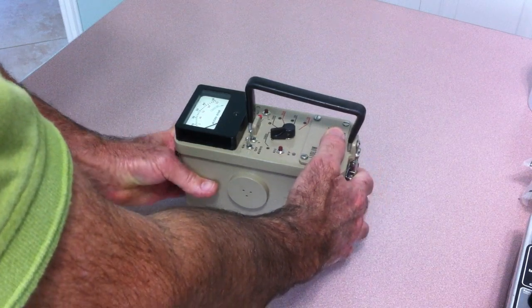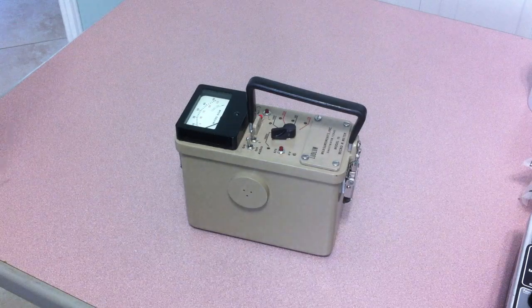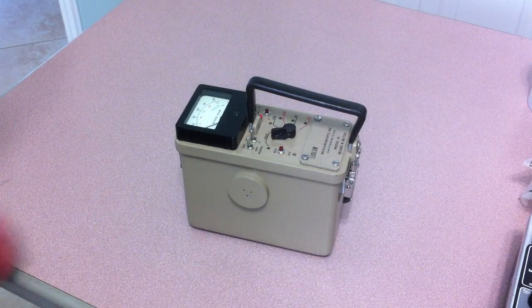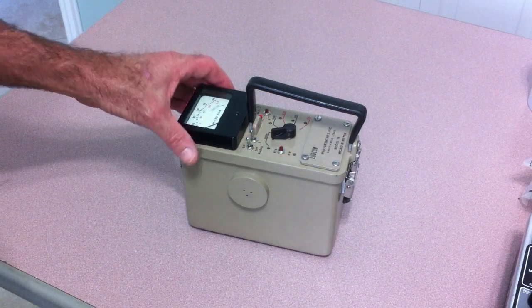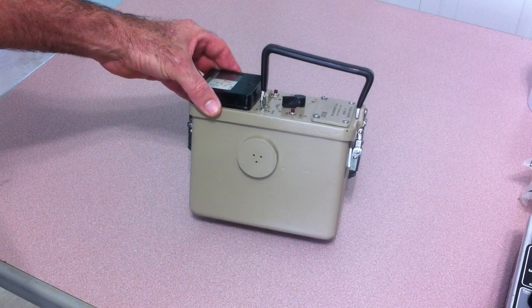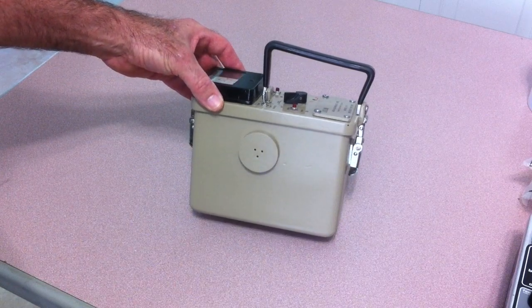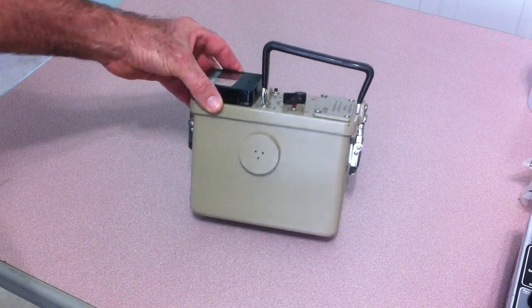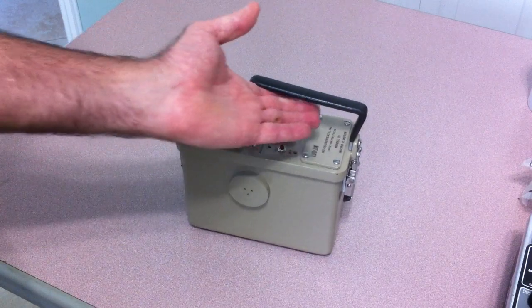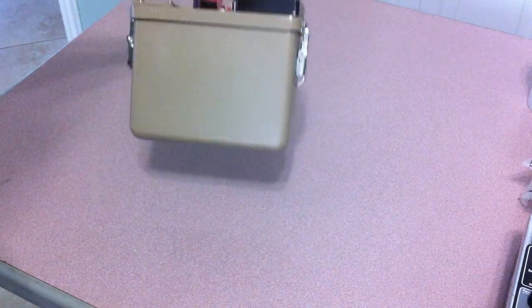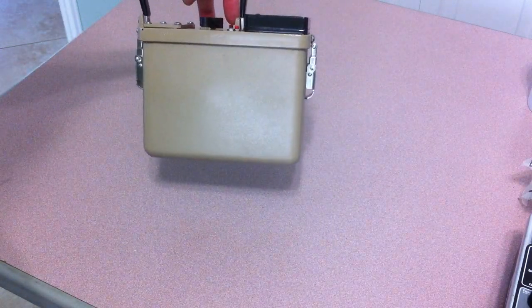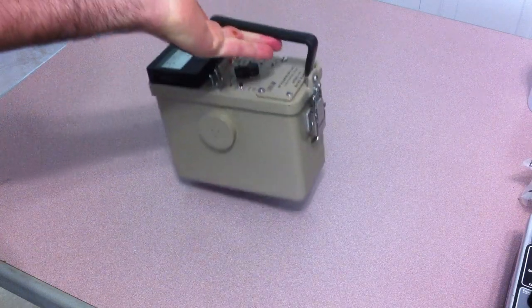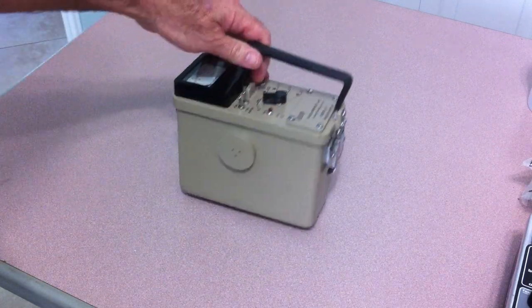What that did was it now has a plastic crystal that is three and a half times approximately the volume of the original one inch by one inch sodium iodide crystal. The advantage of that is that now even with the change to plastic, the increase in volume makes it pretty similar in sensitivity to gamma radiation but with the huge advantage of it now being non-hygroscopic.